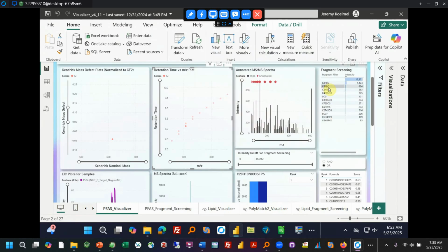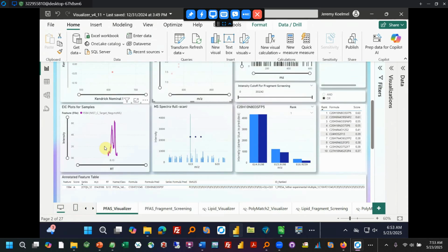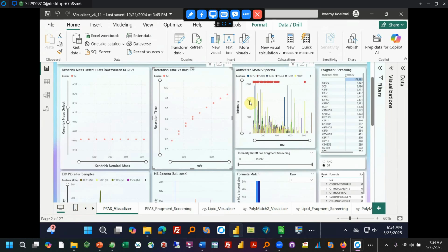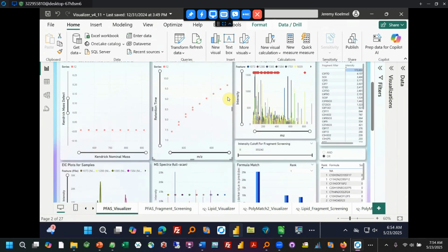So that's an interesting case where there could either be branching or there's other isomers mixed in and they're shifting where that peak height is, and there definitely are other isomers. So with that, there's definitely two isomers in all cases. They all have good fragmentation. Again, you probably won't see fragmentation for all of yours. This is an ideal data set.